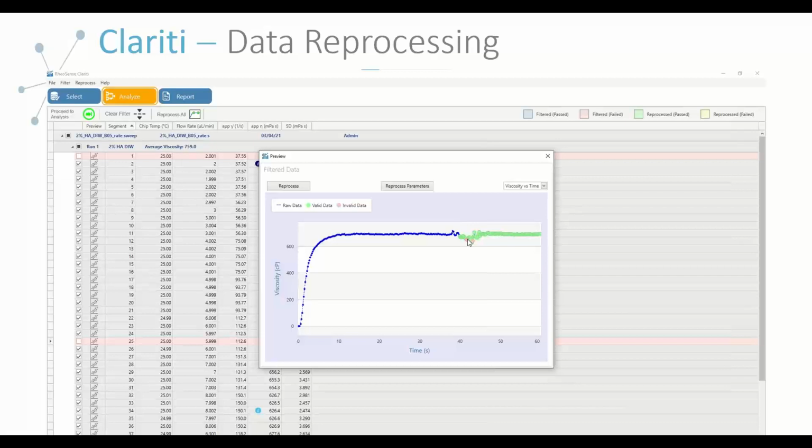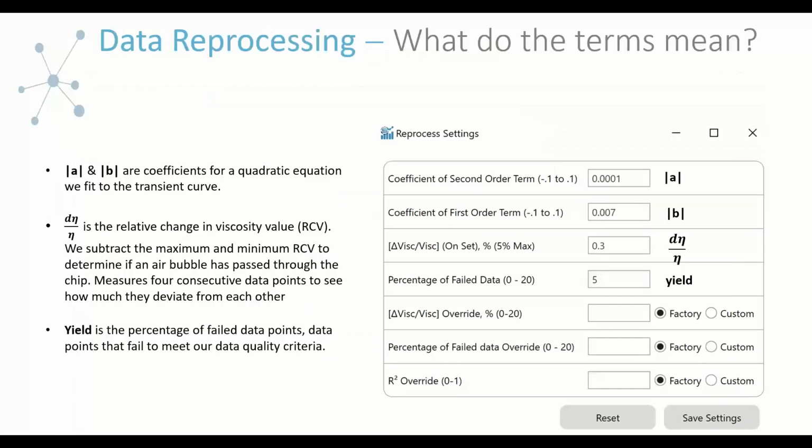However, if you think this data is good, that you could use perhaps the transient plateau here in conjunction with this plateau here, you can refer to that raw data export in Excel, and you can do the averaging yourself. As of right now, Clariti does the whole thing. You can't pick and choose which part of the transient curve you want to use. I believe that's for CFR compliance purposes.